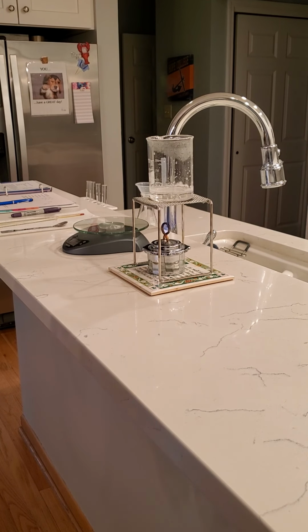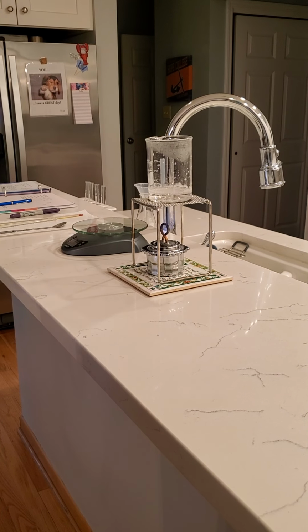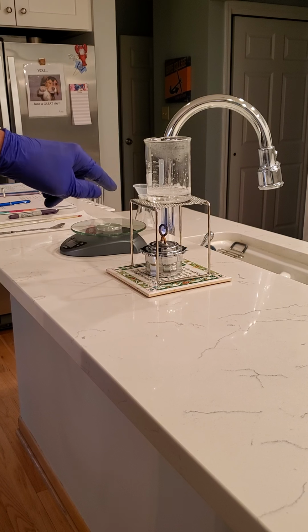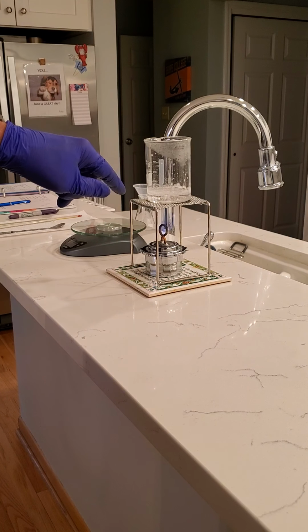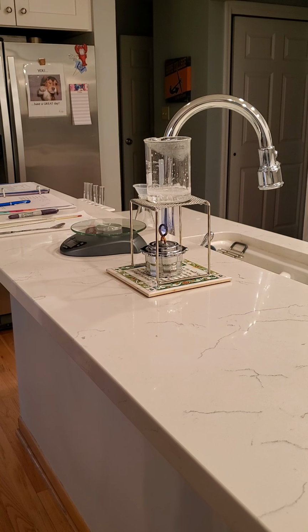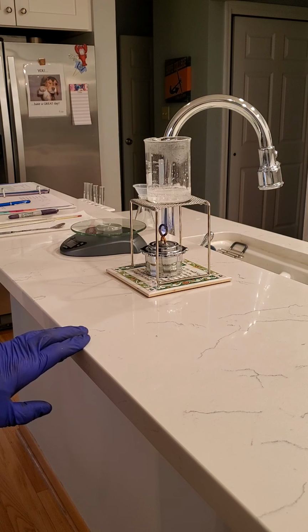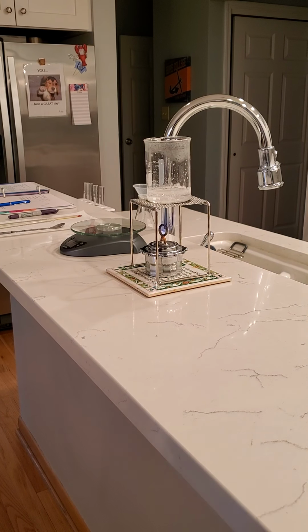Okay, class, now we can see as the water is evaporating, there's less and less water in the beaker. There's less and less water to dissolve the salt that's there. We're actually seeing solid salt coming out of solution, being deposited on the sides of the beaker as the amount of water decreases. Getting down to about halfway of the water removed, we're going to cool it and weigh it and see how much salt we have left over, and that'll give us the solubility in grams per milliliter of sodium chloride in water.